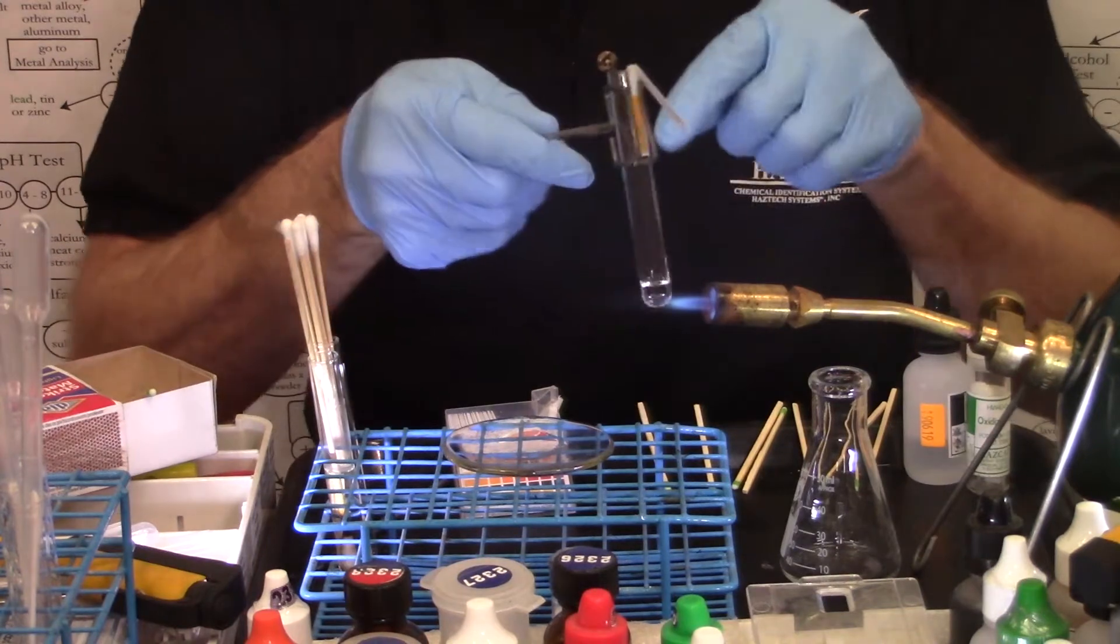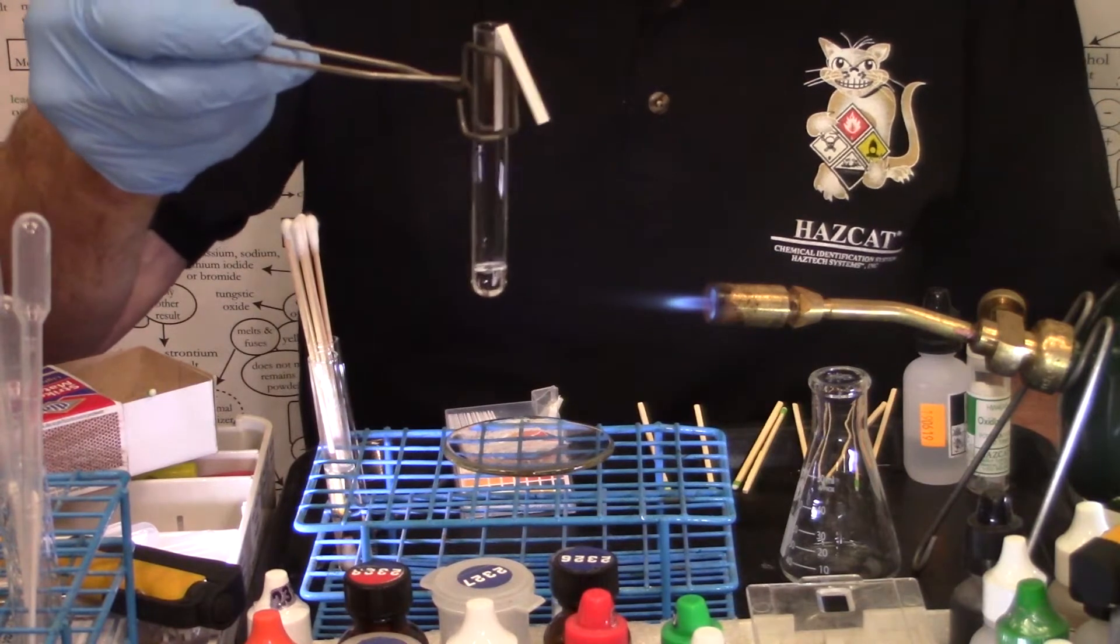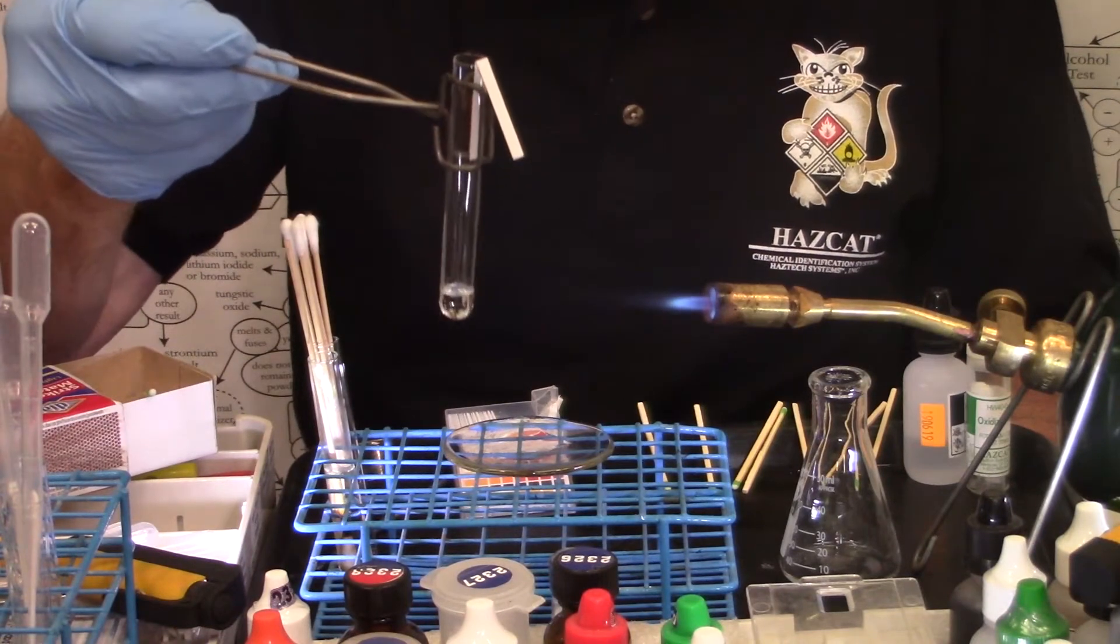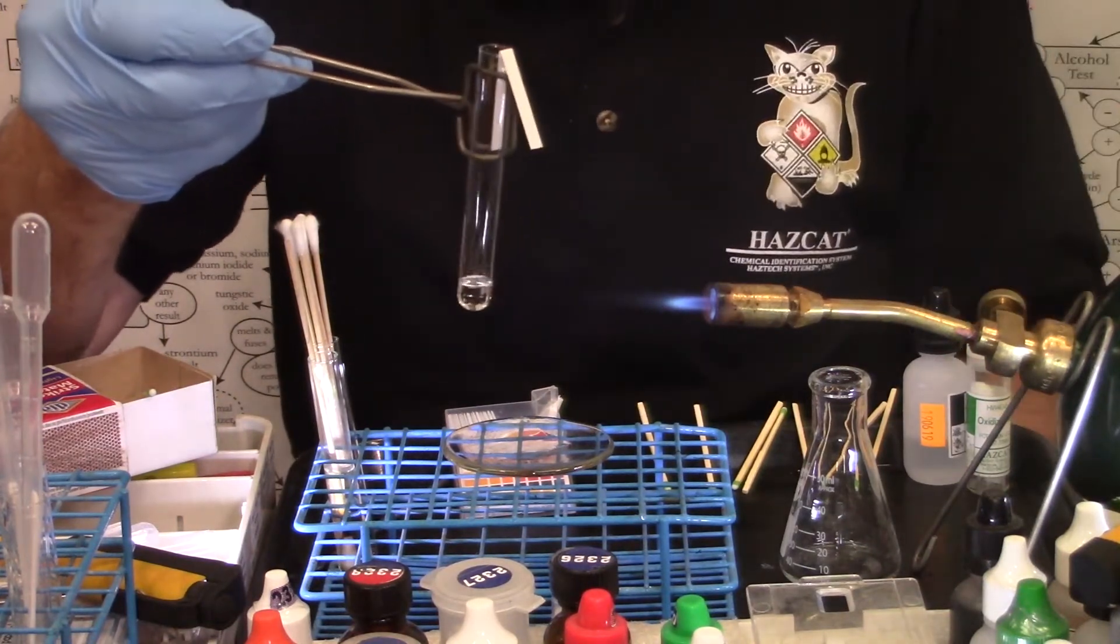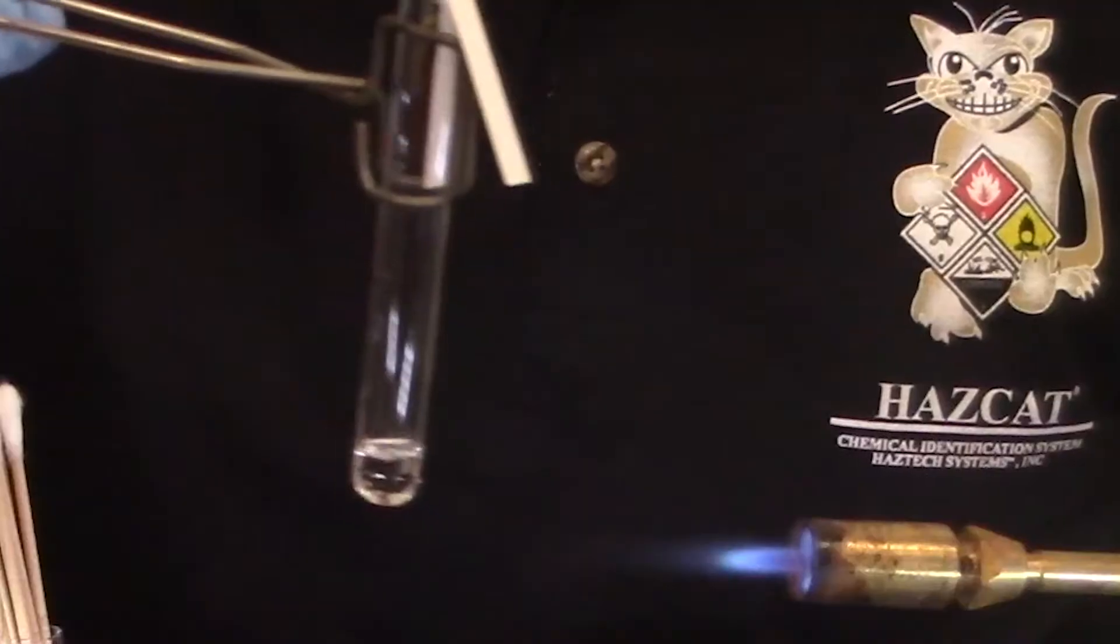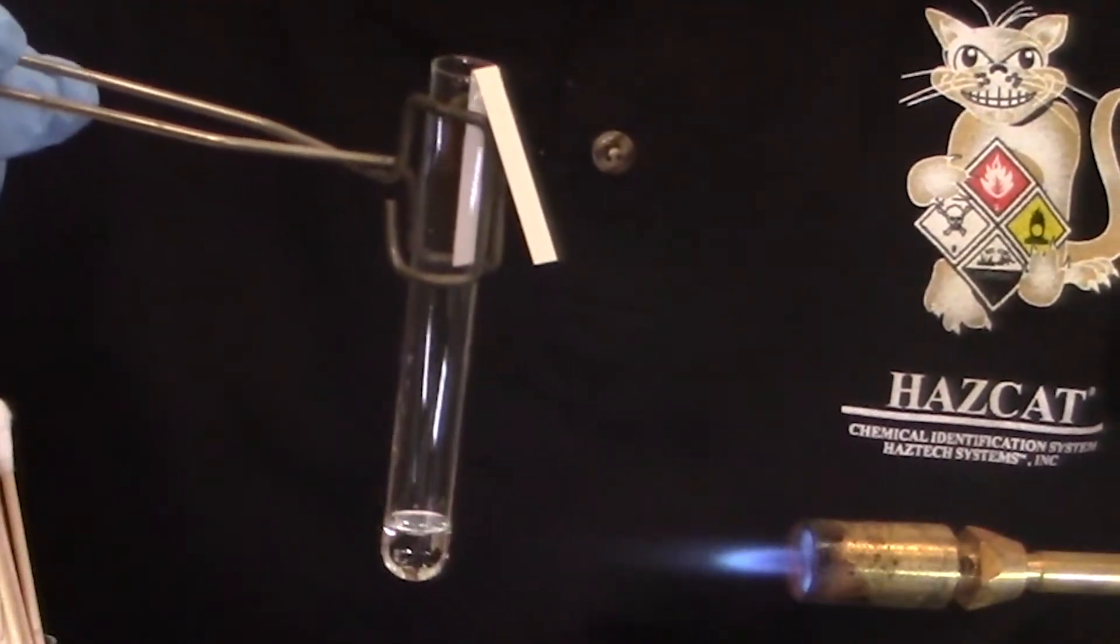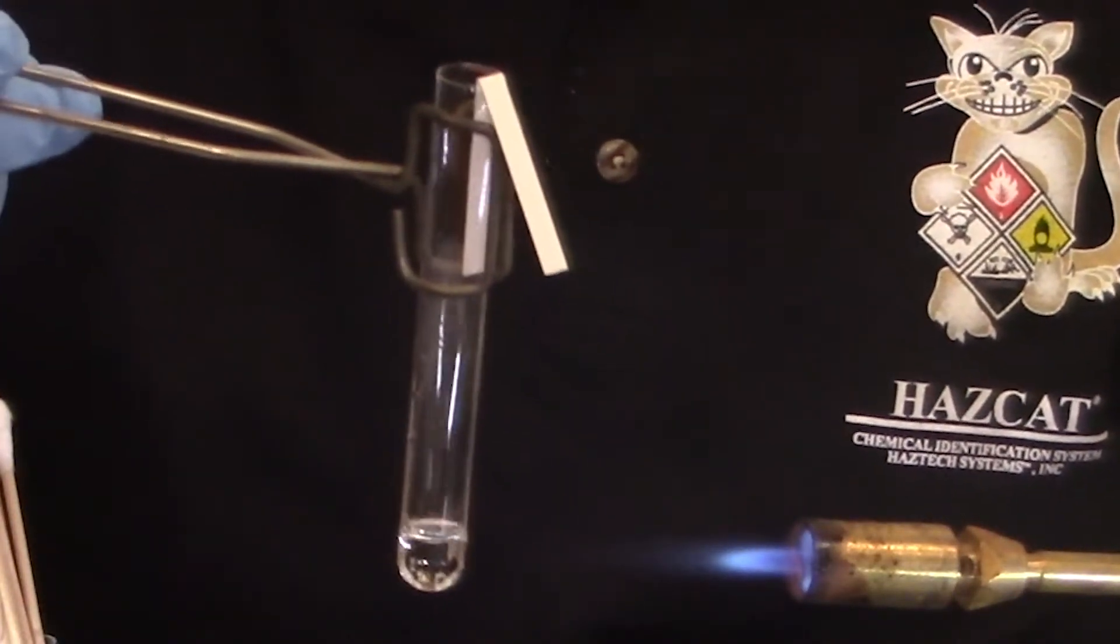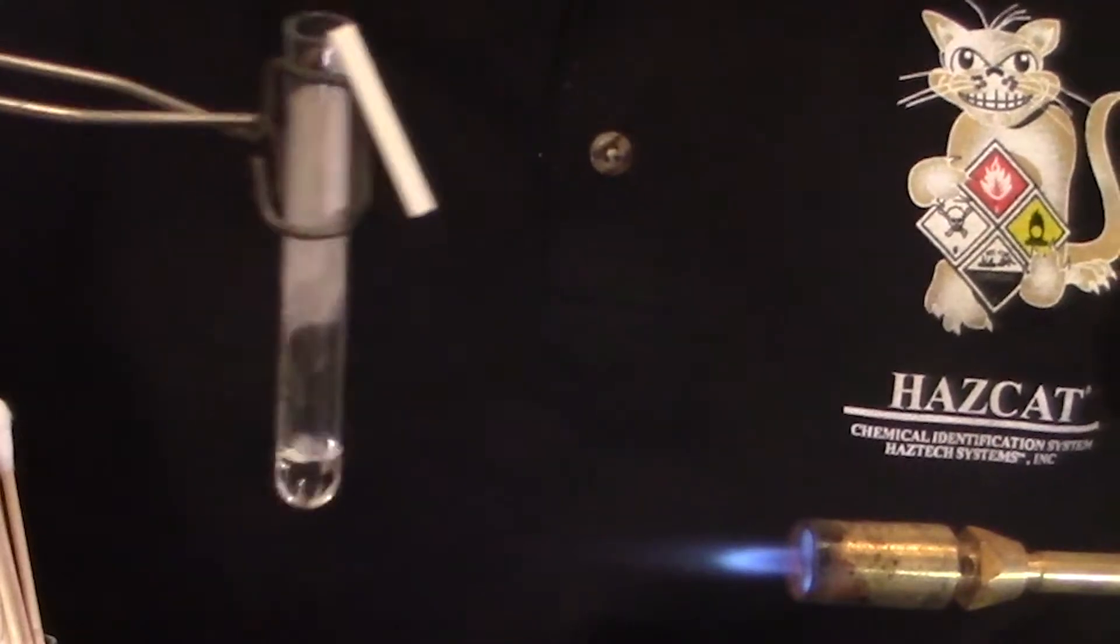Now I take my test tube with my pH paper hanging in it and gently about an inch or so away from the tip of the inner blue cone of the flame. I'm going to warm up the liquid while I watch the pH paper. When you heat a liquid, you always try to keep the heat above the surface of the liquid, heat it from the top down, never get underneath it, it could bump, boil, and shoot liquid out of the test tube.